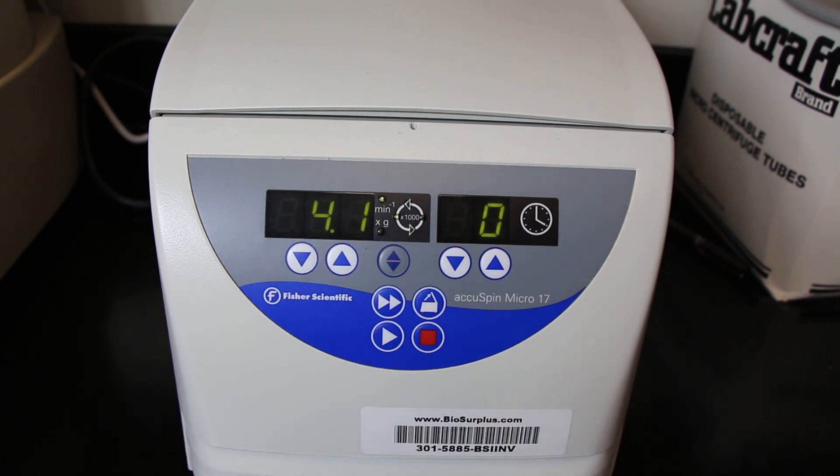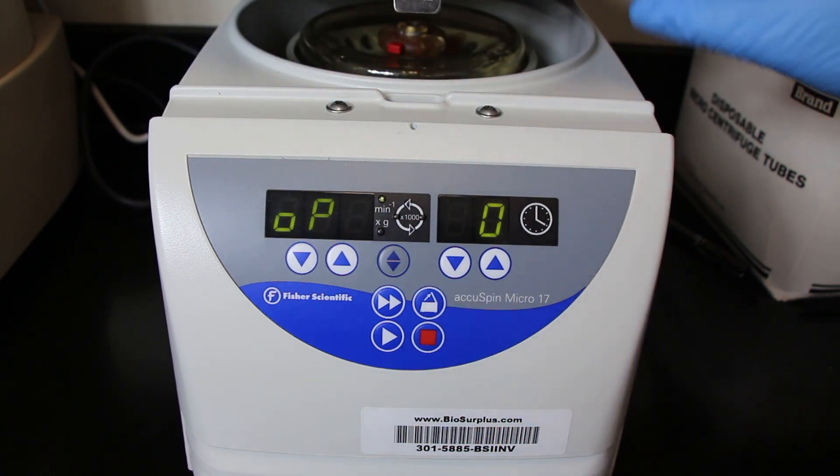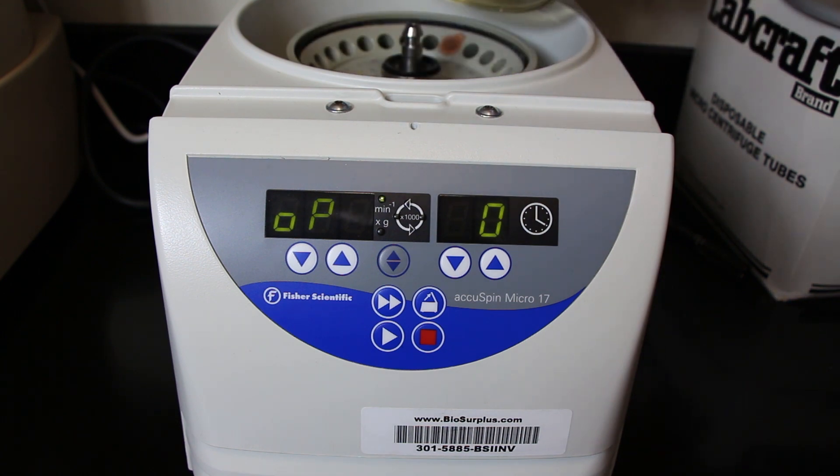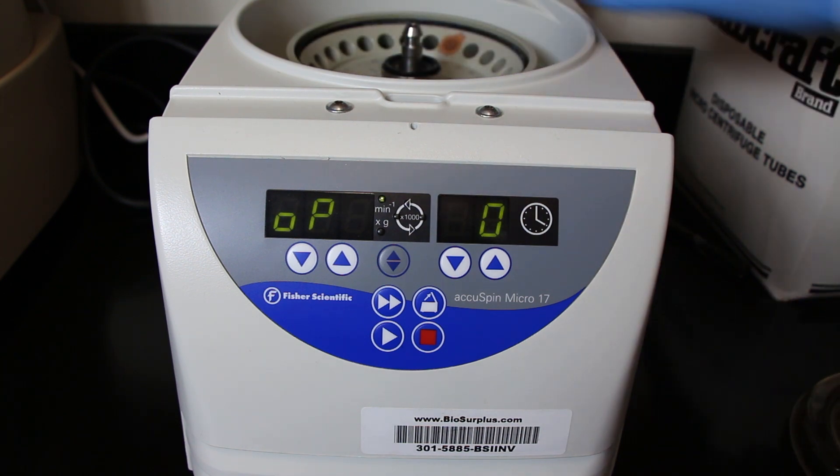When the centrifuge has come to a complete stop at the end of its spin, you can simply hit the button that will open up the centrifuge lid, remove that plastic disc just like you did before, and take out your samples. When you take out your samples, make sure that you don't invert them in any way because you're just going to remix your sample.